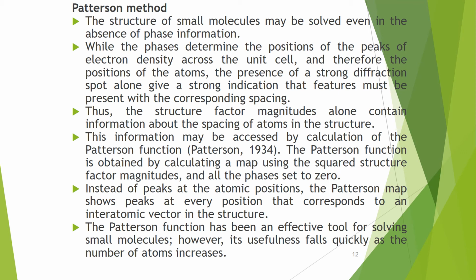The Patterson function is obtained by calculating a map using the squared structure factor magnitudes and all the phases set to 0. Instead of peaks at the atomic positions, the Patterson map shows peaks at every position that corresponds to an interatomic vector in the structure.